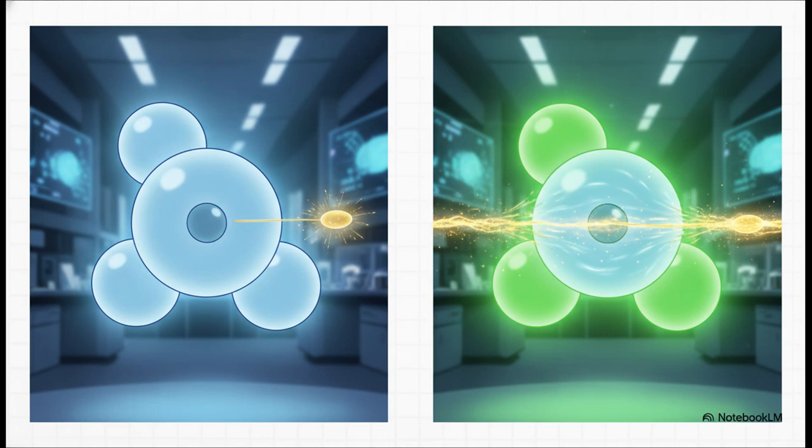But here is where XPS truly flexes its muscles. It doesn't just tell you that an element is present, it tells you what that element is doing. You see, the binding energy of an electron changes just a tiny bit depending on the atoms surrounding it. We call these minute variations chemical shifts. For example, if a carbon atom is bonded to a highly electronegative atom like fluorine, the binding energy shifts noticeably. This is huge. It allows researchers to distinguish between completely different oxidation states. You can look at a piece of iron and definitively say, this part is pure metallic iron, but over here it's begun to form iron oxide.